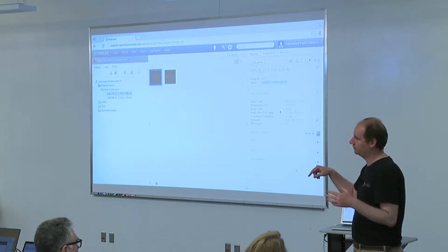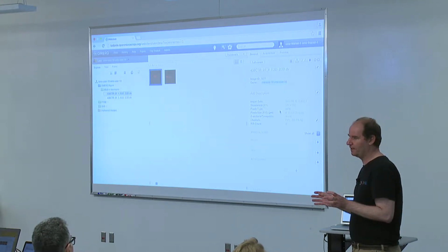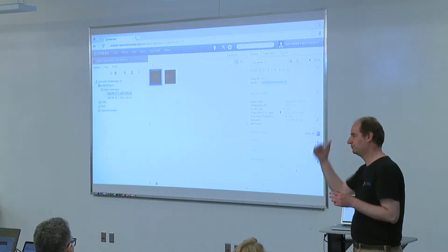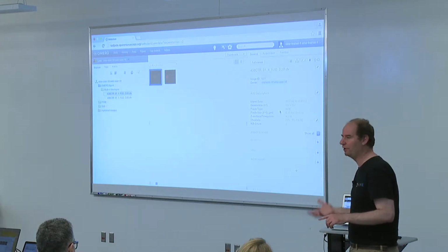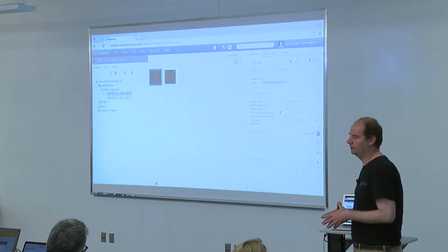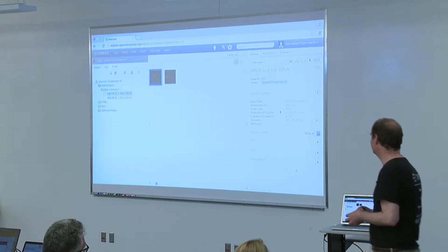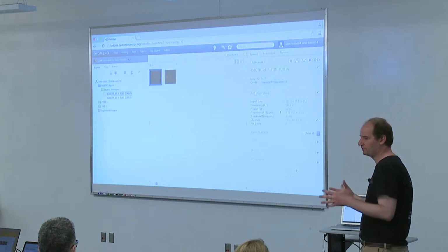Furthermore, by default, the first group you would create would be a private group, and there everybody is on his own. But if you are an administrator, you can transform the groups from private to read, annotate, or whatever tactics you choose as a group, as an institute, as whatever. And if you want to publish, you can transform the group to a public group, which would then be viewable, of course, usually via OMERO Web, to the whole world. Of course, you would do it with reason, but in this manner, you can create a public repository. So this is the cooperation strength of OMERO.